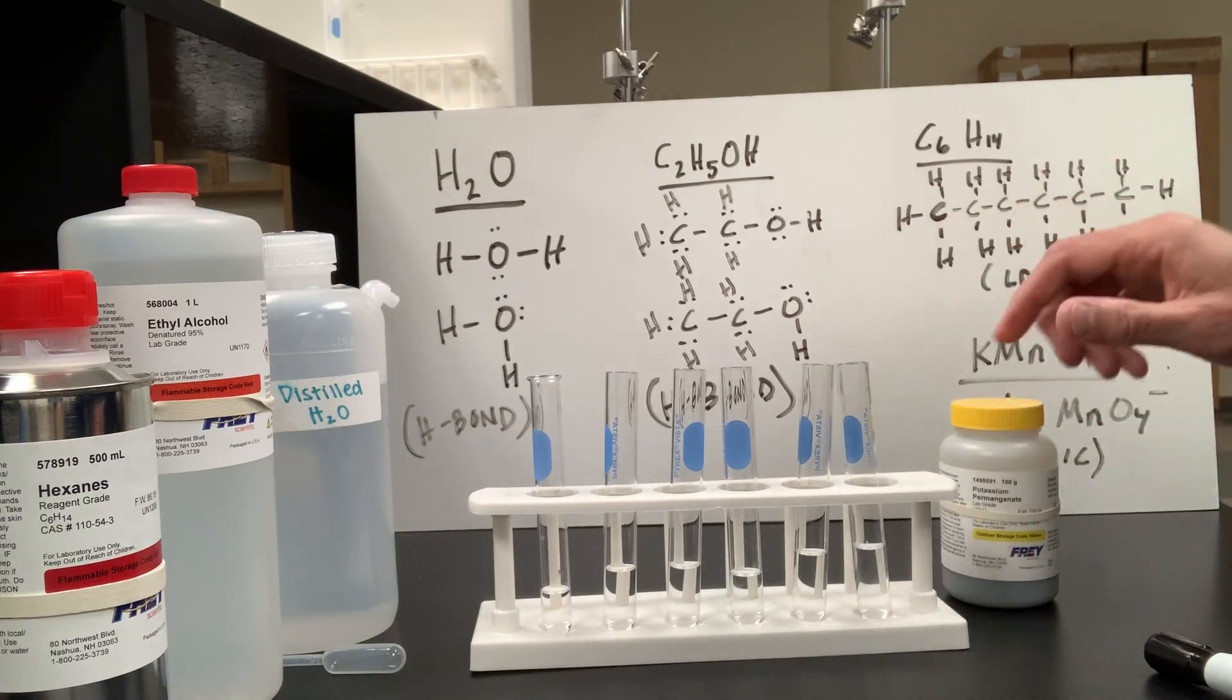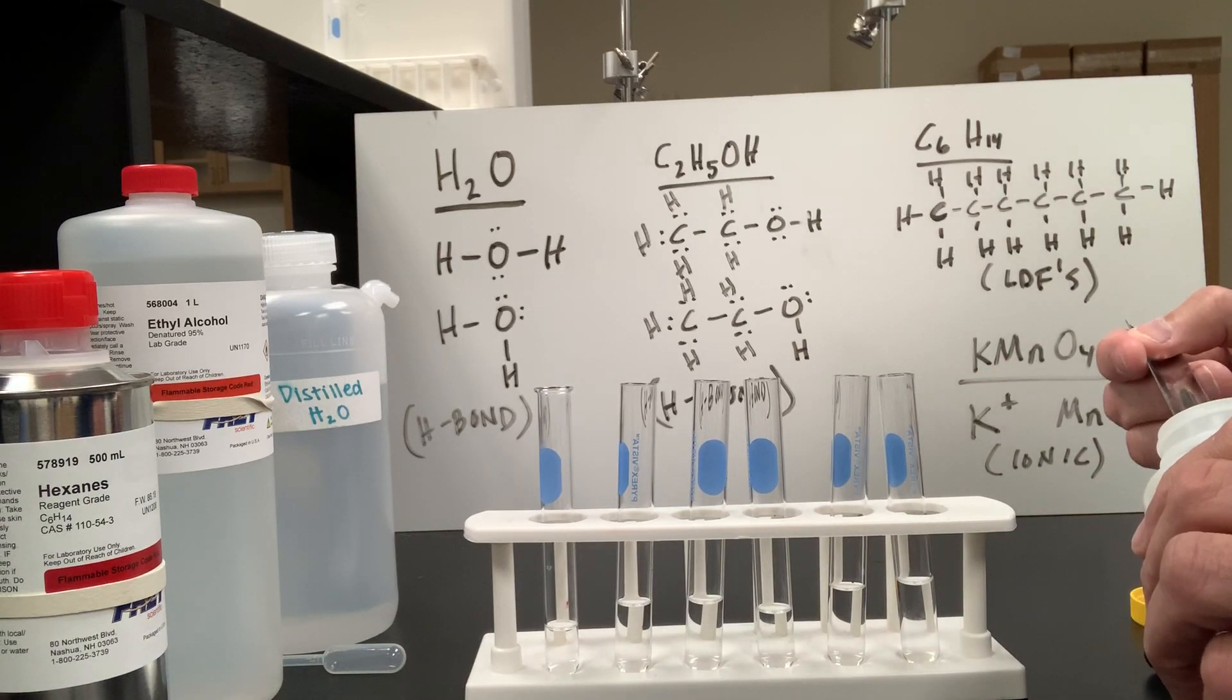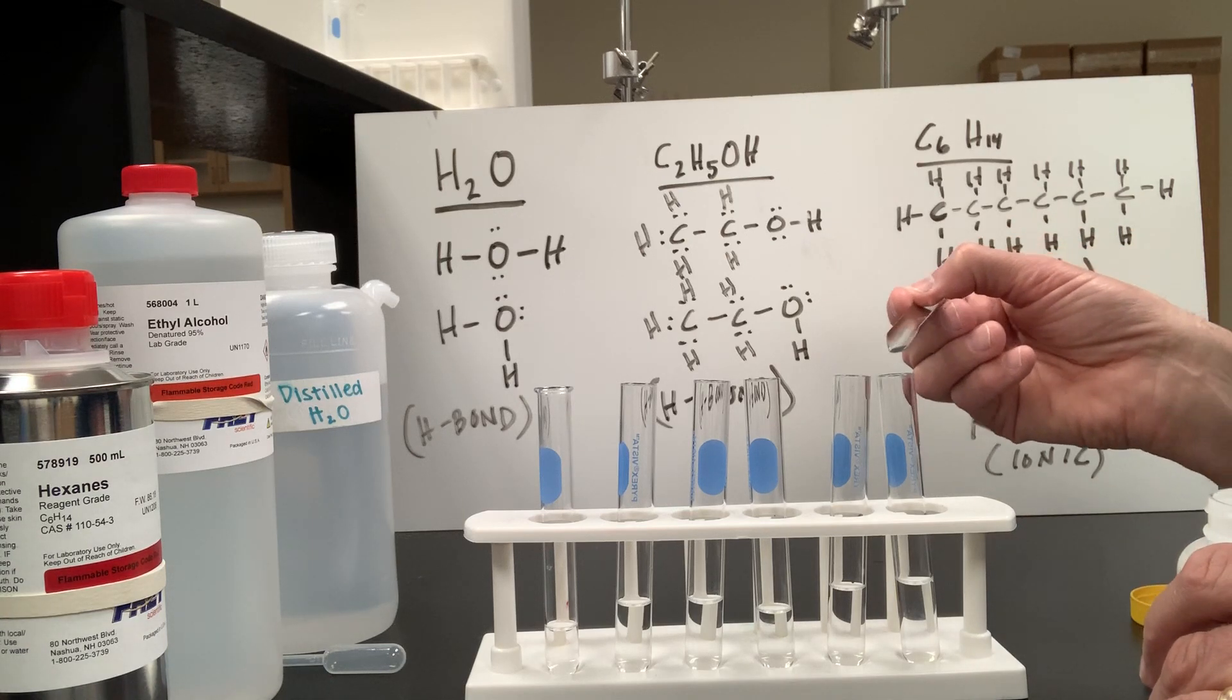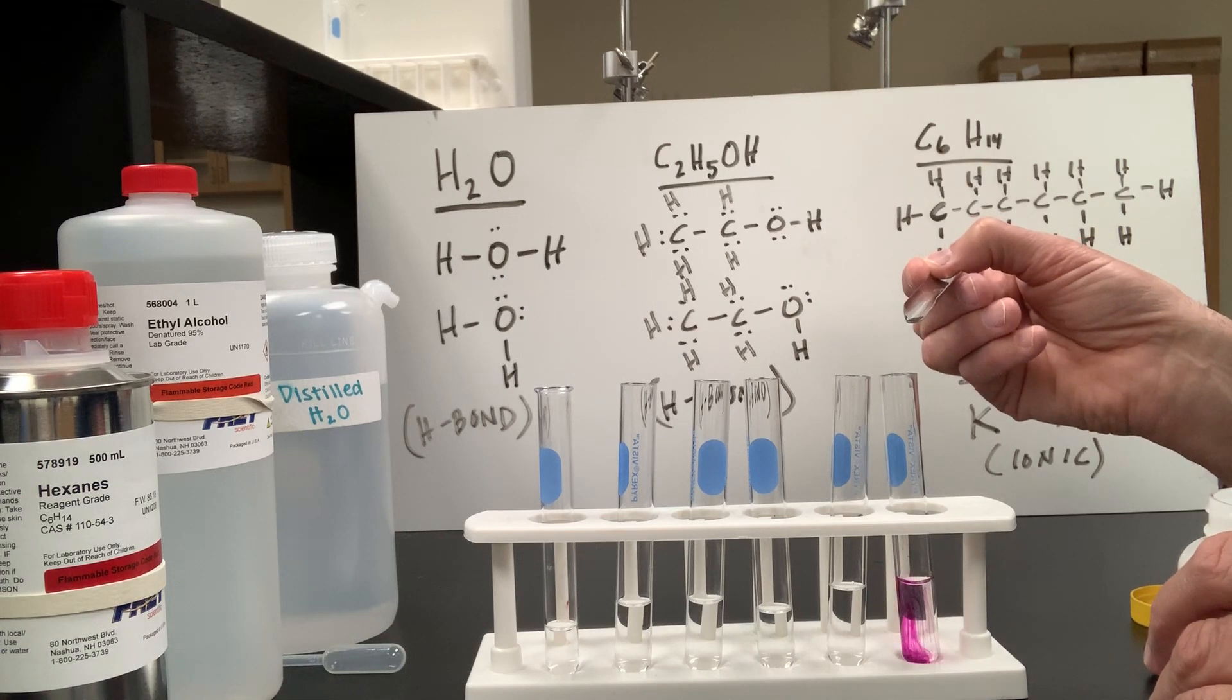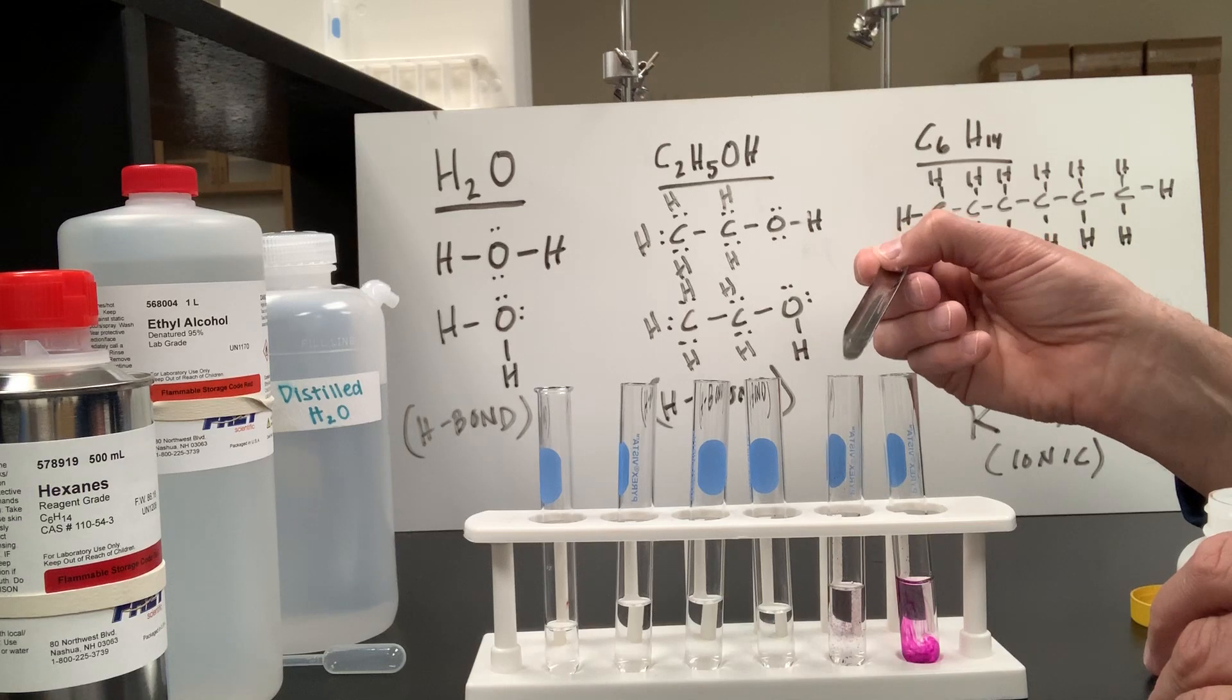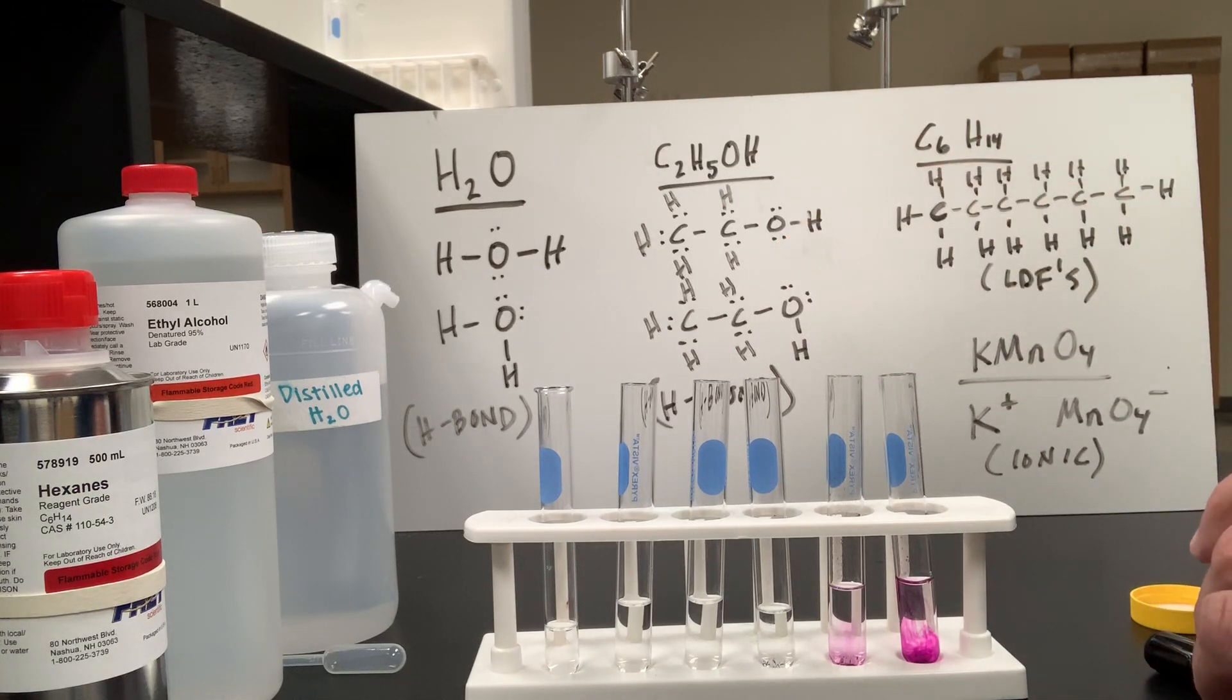Remember, my first test tube has water in it, and we're going to put a little bit of potassium permanganate in each of the first three test tubes to see how the solubility of the ionic compound does in each of these liquids. So here is my water. Let's put a few crystals in there. Here is my ethanol. Put a few crystals in there. And then my hexane with a few crystals.